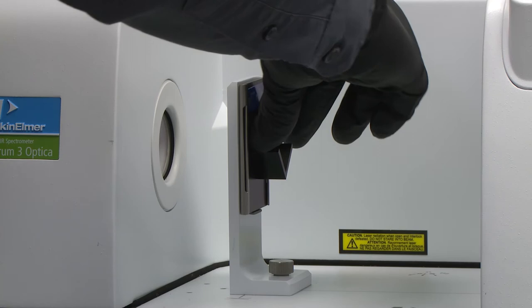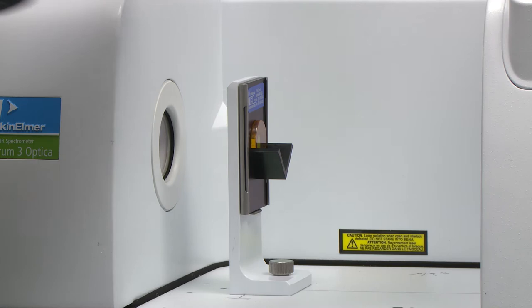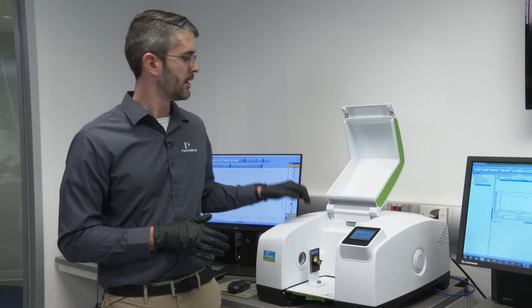When you place that sample within the beam path in an FTIR, because of the higher refractive index of the sample, a portion of light is actually reflected from the sample surface.